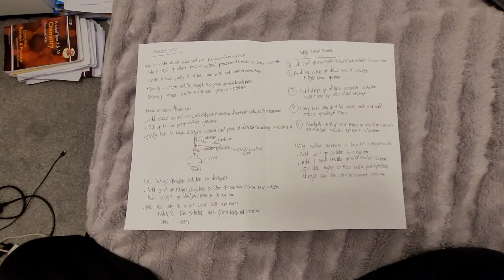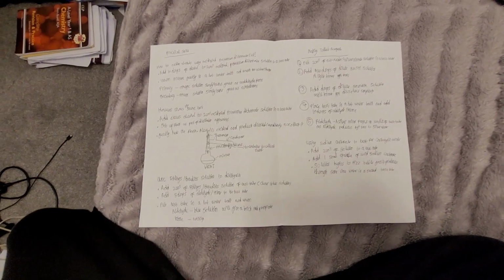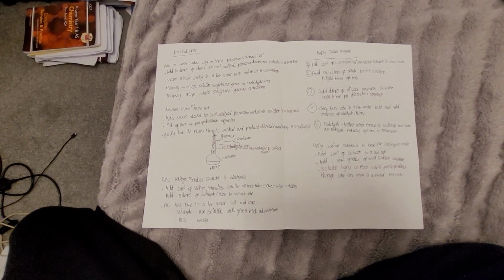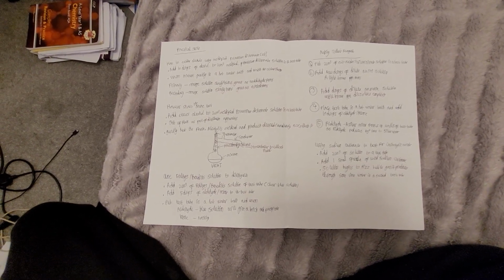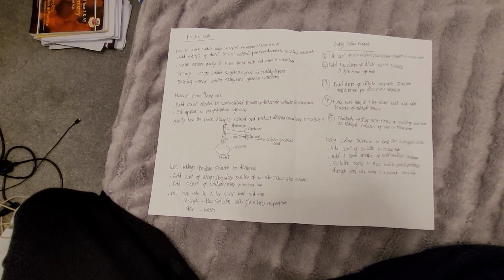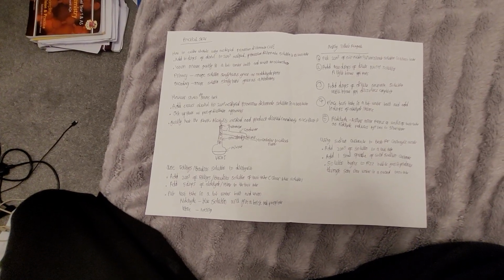Some practical skills. So, how to oxidize alcohols using acidified potassium dichromate. Add 10 drops of alcohol to 2 cm³ of acidified potassium dichromate solution in a test tube. So add 10 drops of alcohol to this much of acidified potassium dichromate solution in a test tube. Warm the mixture gently in a hot water bath.